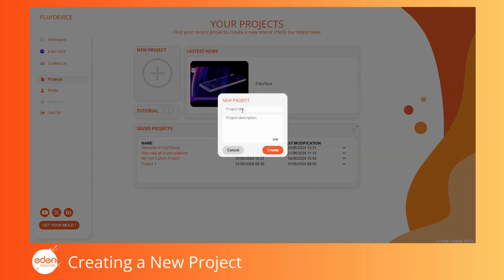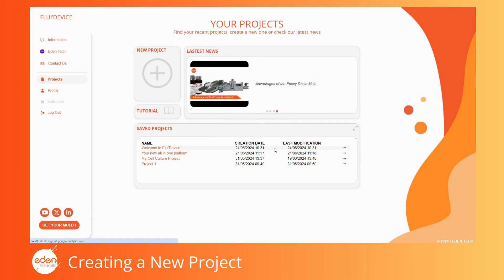After clicking accept on a new project, or when clicking on an existing project name, you will be taken to that project's page.